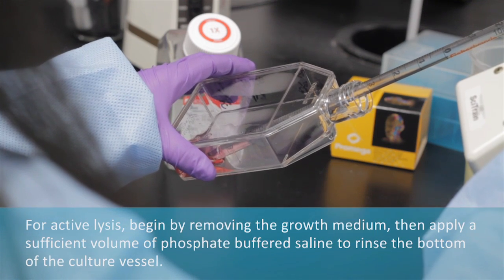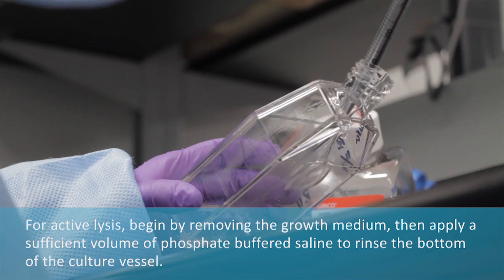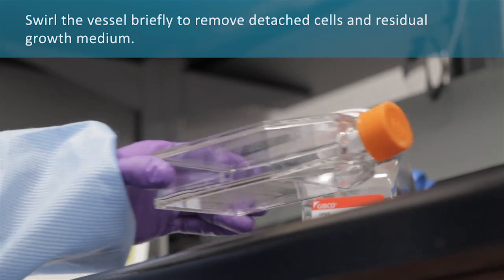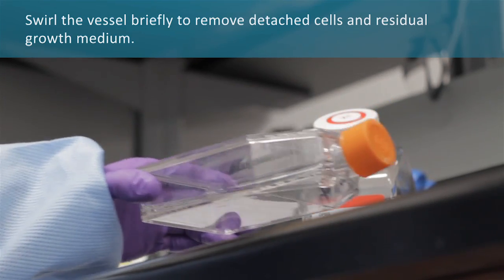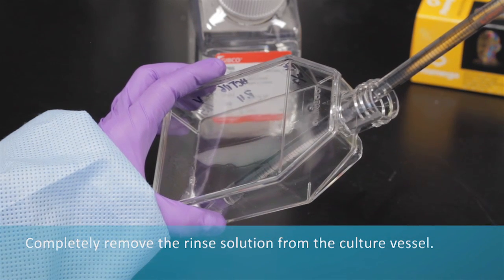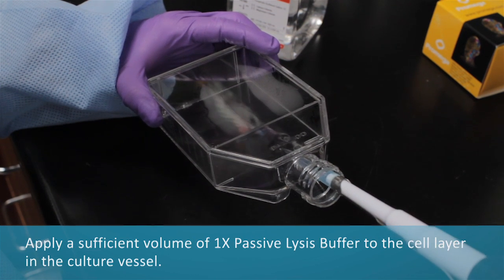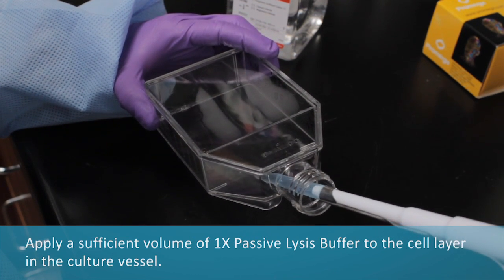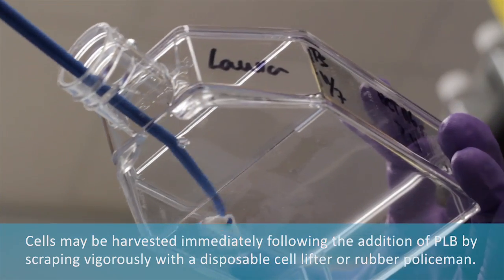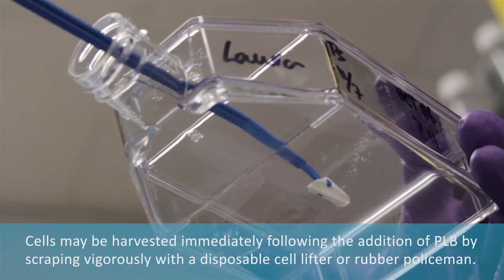For active lysis, begin by removing the growth medium, then apply a sufficient volume of phosphate buffered saline to rinse the bottom of the cultured vessel. Swirl the vessel briefly to remove detached cells and residual growth medium. Completely remove the rinse solution, then apply a sufficient volume of 1x passive lysis buffer to the cell layer. Cells may be harvested immediately by scraping vigorously with a disposable cell lifter or a rubber policeman.